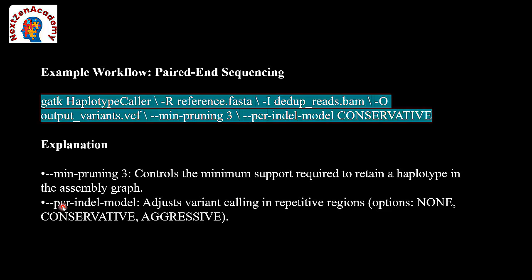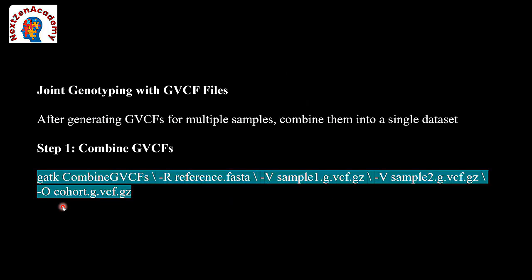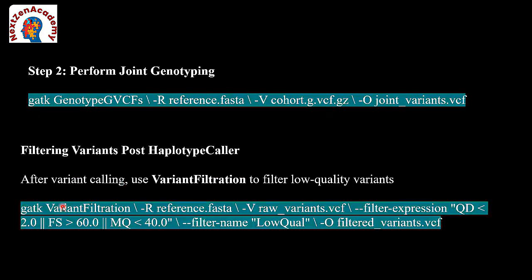Like if we have a specific set of gene list, we want to know that gene specifically from the whole set of samples. In that condition, we need to give the dbSNP VCF file, and we'll get the sample variants. So dbSNP is a reference VCF with the known variants.